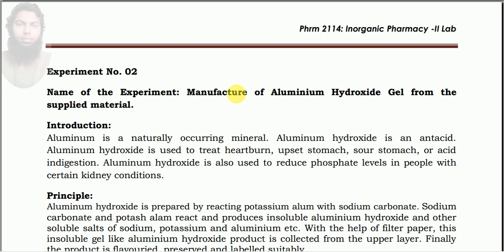In the name, there is a term known as aluminium hydroxide. Aluminium hydroxide is the common term known as the antacid. For our general gastric antacid disorder or gastric antacid problem, the drug we generally take is the antacid of Square Pharmaceuticals Limited or any other form of gastric antacid. So aluminum hydroxide is basically one of the ingredients of those antacid tablets.